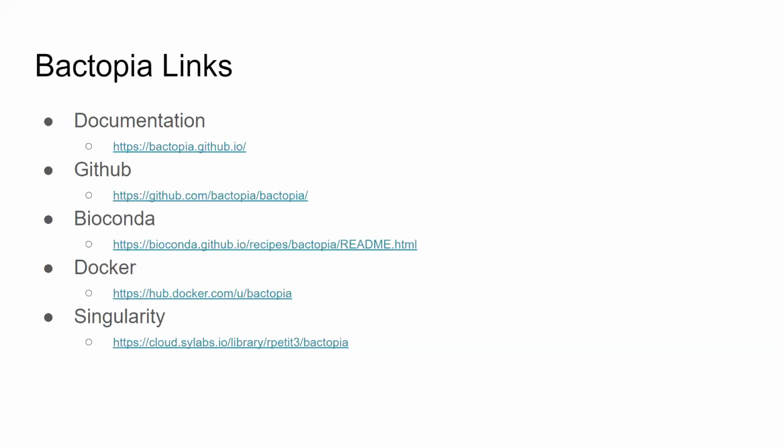Let's see. Yeah, is it quantified somehow automatically? It's based on those 4 criteria, which you as the user can adjust. Do I have specific thresholds per genus or taxon? Nope, because as the user, I think that should be up to you. Just because for Staph aureus data, I know what kind of looks good and what doesn't, whereas tuberculosis, I have no idea. Somebody may be like, yeah, you probably don't need this much, so you could probably adjust those.